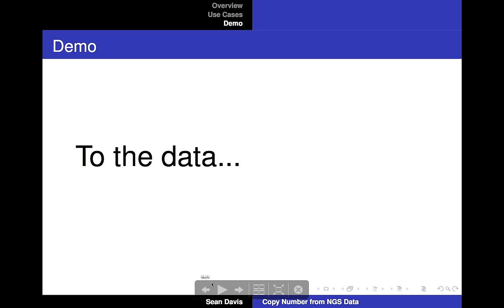And is there any way to normalize sequencing data between samples that were sequenced on two different machines? In terms of normalizing, I'm not sure which question we're asking, but if we're talking about between tumor and normal done on different machines, we've never tried to do that.